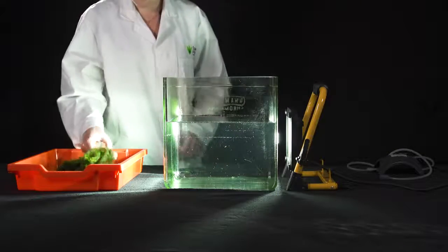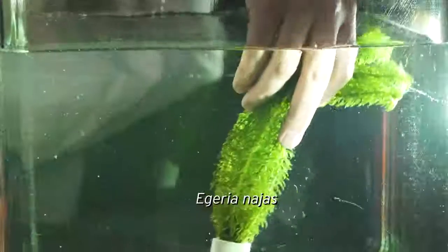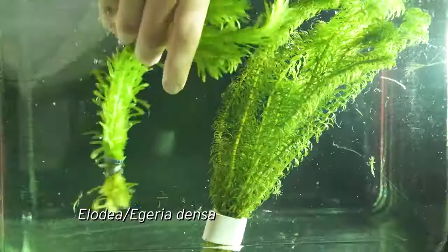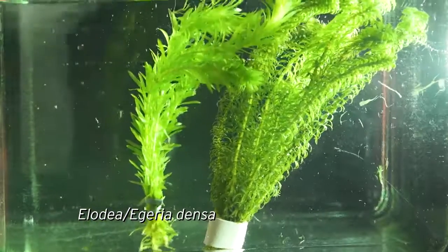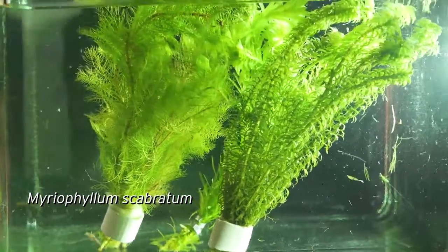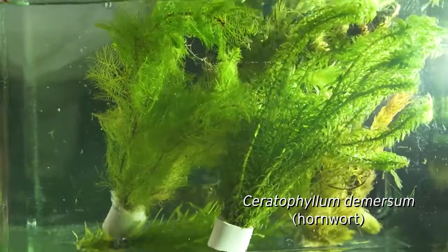Temperature is important when your pondweed first arrives in the lab as well. Many of the species we use are tropical, so plunging them into a tank of cold tap water will cold shock them. Tap water is fine to use, but allow the tank to come to at least room temperature or even slightly warmer before placing the pondweed into it. Also, make sure that the tank is aerated.